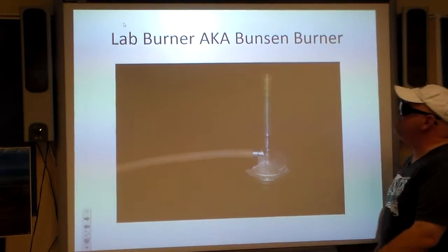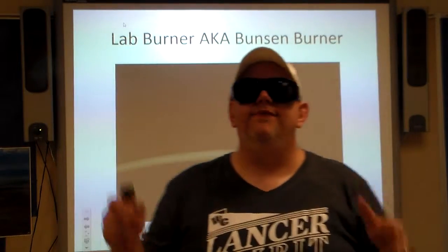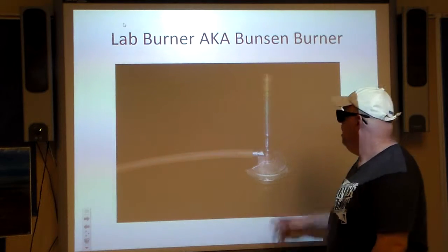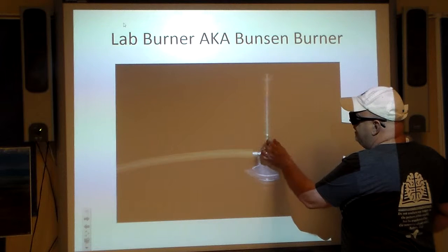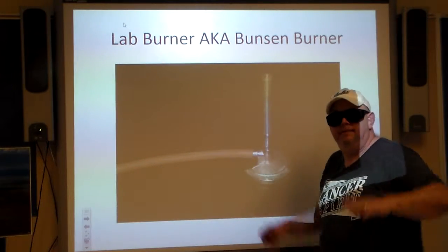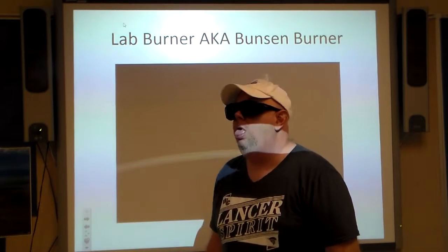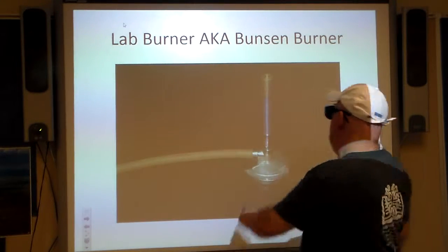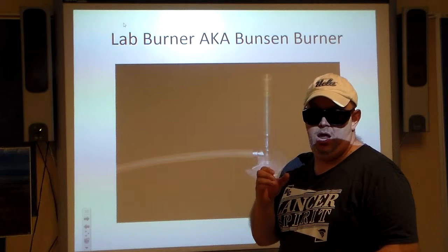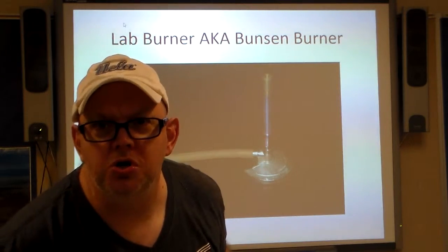Lab burner, also known as a Bunsen burner — there are different kinds of lab burners. Robert Bunsen invented this particular style, and this is it right here. We connect it to a gas source; there's a tube that spreads the flame out, and a collar at the bottom you can turn to control how much air mixes with the gas. For us here, we keep the collar closed to maintain a steady flame. I also have a couple of the very large 'mucho macho grande' burners — they're extremely hot.